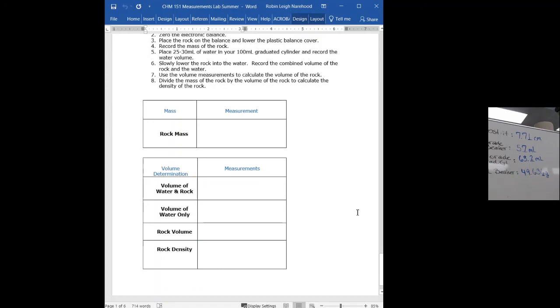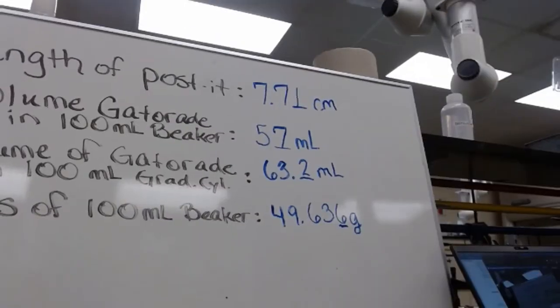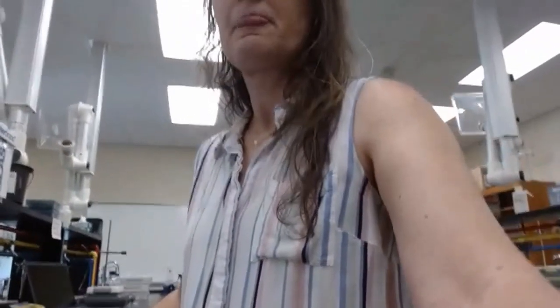As you read over it, each of these, you want to think about what it's saying to do. Try to envision yourself doing this. Think about what's important for the measurement. But this experiment is simply a way for you to practice taking measurements correctly, working together with someone, and also following a procedure.